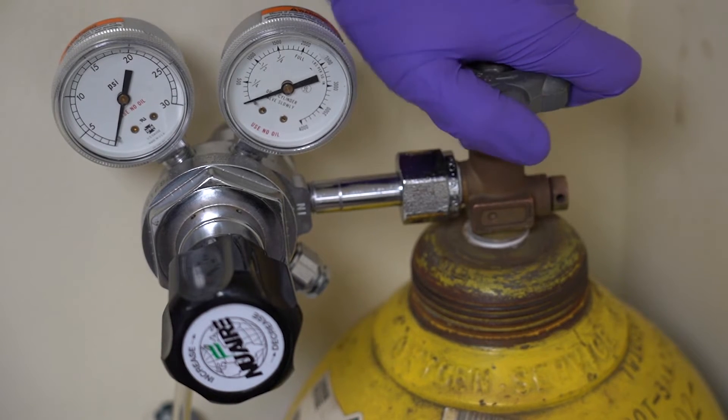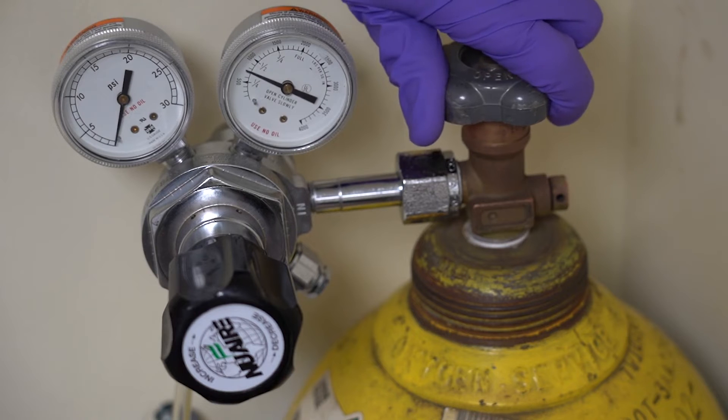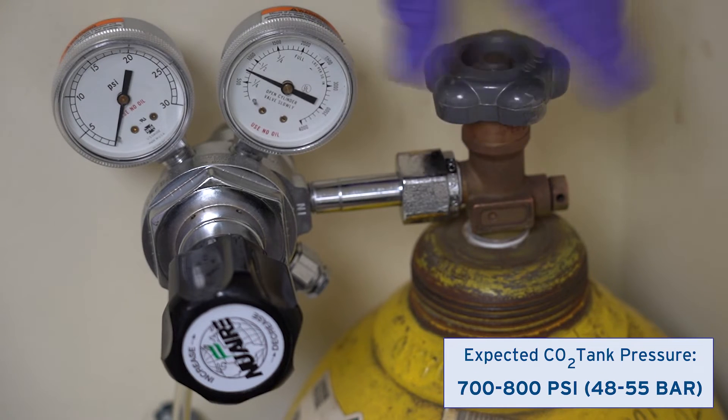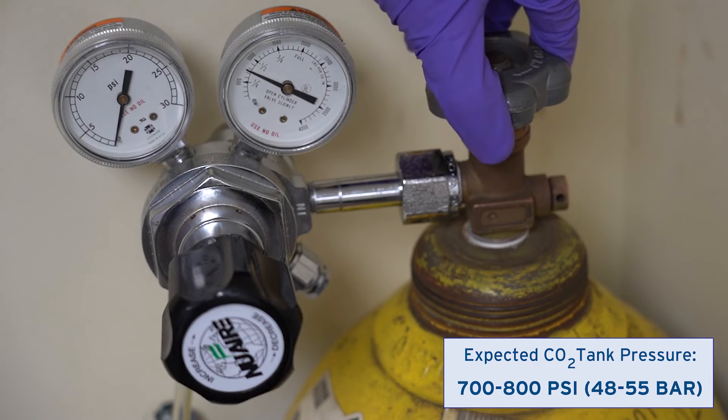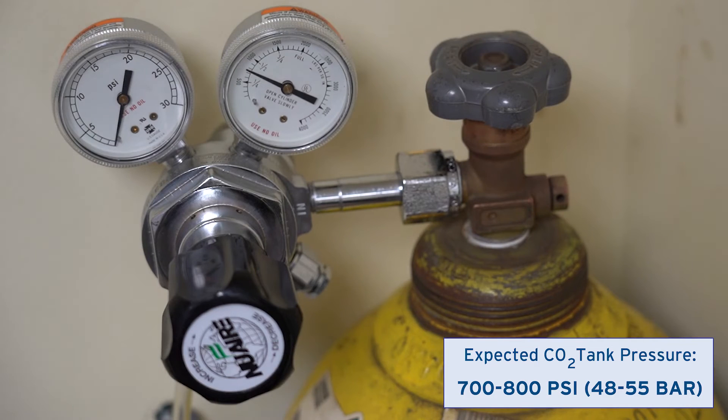Stand clear and open the valve on the CO2 tank. Watch the gauge on the high-pressure side of the regulator increase to 700 to 800 psi or 48 to 55 bar as gas flows into it from the tank.